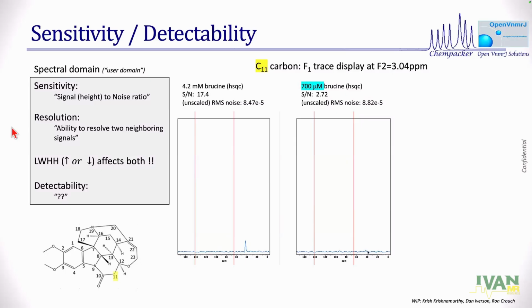So that's the peak you're looking for. From a sensitivity or detectability point of view, that peak is within the 3 times RMS rule that we typically use. The 3 times rule, in a normal distribution of statistics, is a 99.5% confidence level that it is not random noise. It's actually a signal. 99.5% confidence level is 3 sigma over RMS. That's the rule, and this is less than that. So ideally, unless you are gung ho about it, you would take this with a pinch of salt.